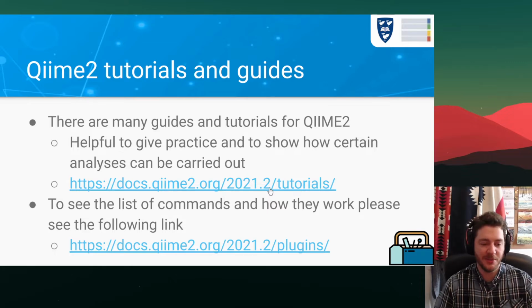I know sometimes time is an issue, but I will say that you'll probably save a lot of time in the long run if you do some tutorials until you're comfortable with it before trying to do your own analysis, if you haven't done much before. And what we would call commands, QIIME 2 calls plugins. So if you're interested in all the various commands QIIME 2 has, you can go to their plugins page.